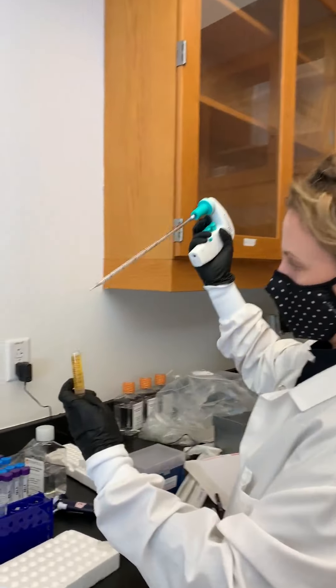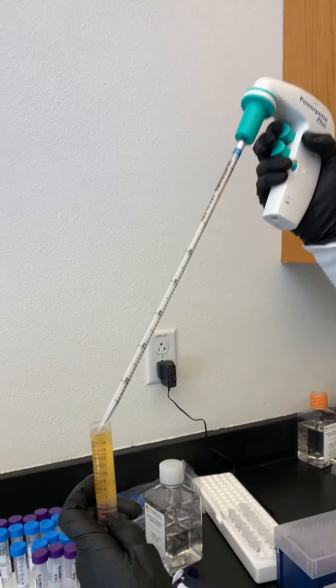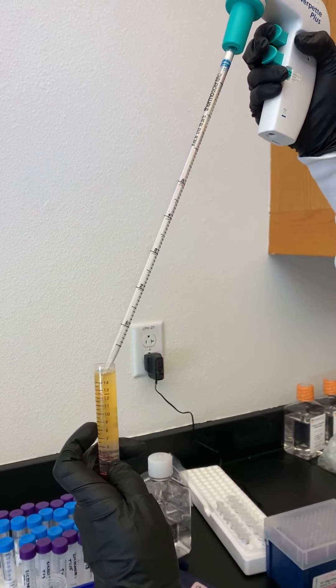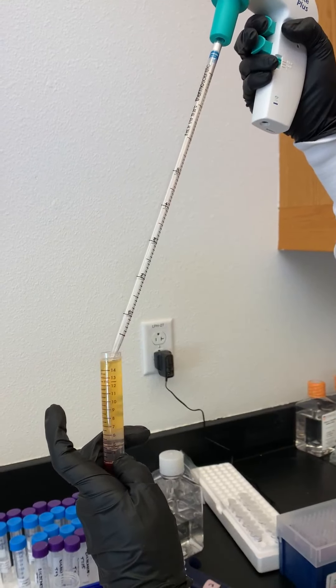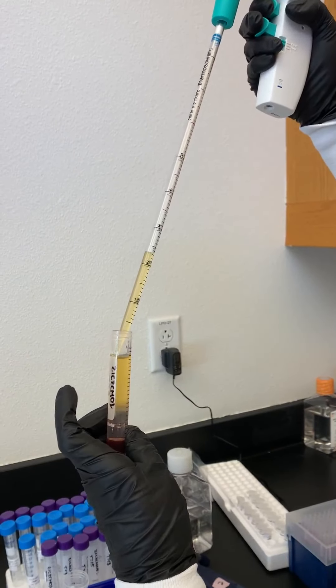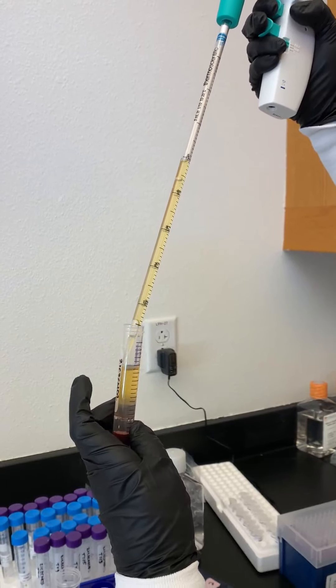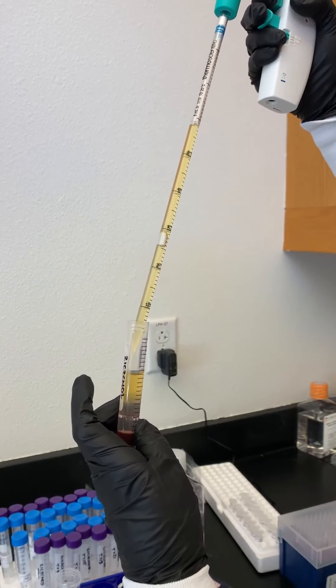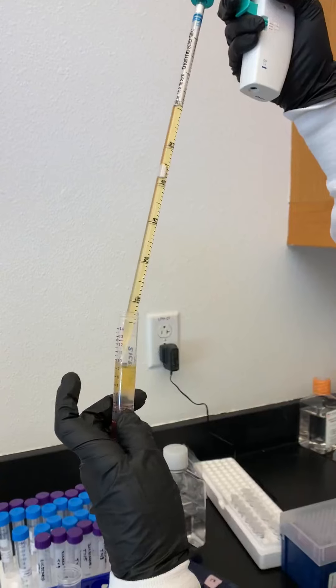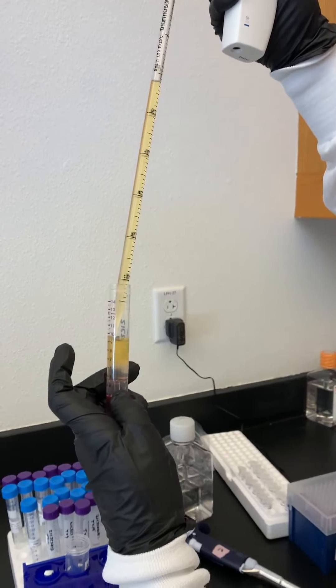As a reminder, the upper button on the pipette sucks up and the lower button presses out. Right now we're sucking up, and we want to be really careful. We're only going to take about six or seven mils off the top because we want to get rid of some of this plasma but we don't want to disturb that clear layer.